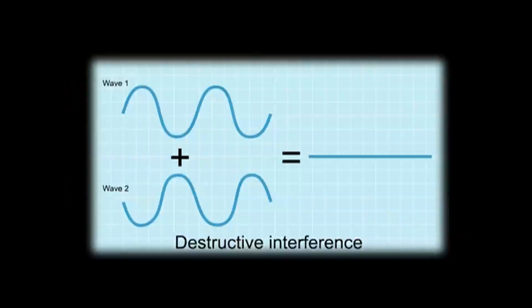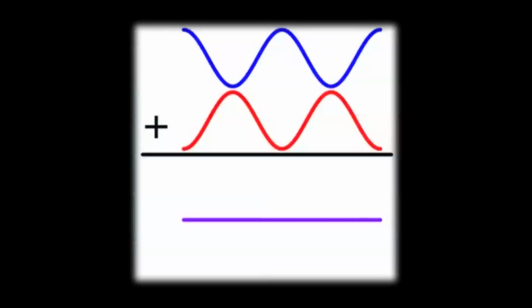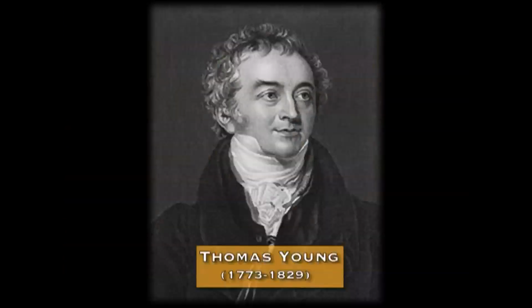It's not that whenever waves interfere, there is an increase in amplitude. If two waves are out of phase by lambda by 2, which is half of the wavelength, then destructive interference may happen, due to which you may not see any light emanating. One of the pioneering experiments which was done to prove such interference patterns was by Young, which is known as Young's double slit experiment.